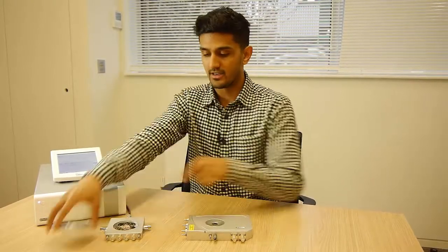Hi, my name is Shrey and in this video we're going to talk about a couple of the probe stages that Linkam create. Over here we've got the HFS 600 PB4 and here is the LTS 420 PB4.